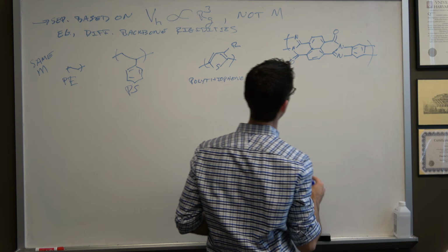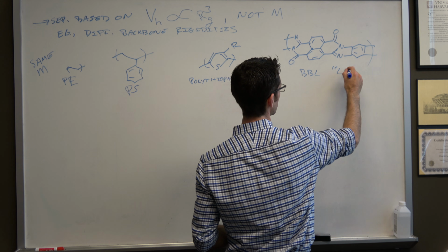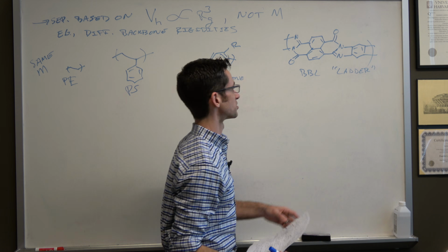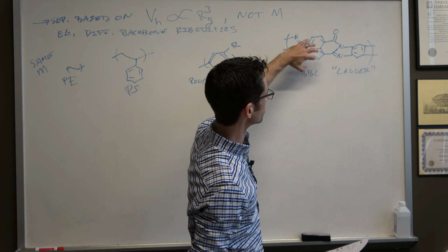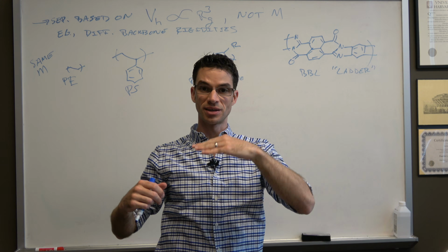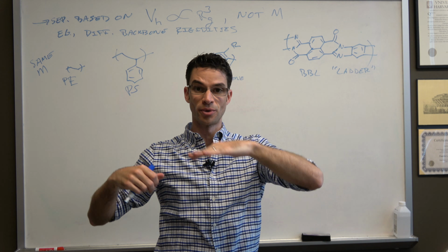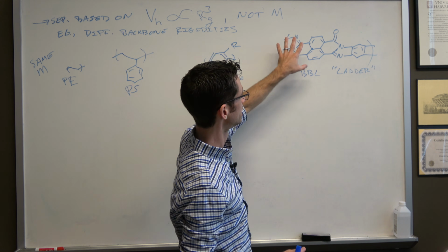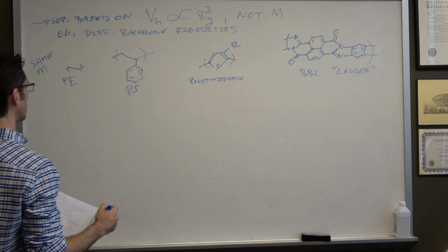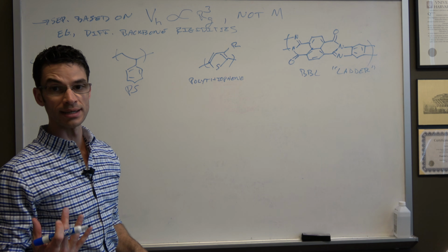This is a ladder polymer called BBL. And it's called a ladder polymer because it has rungs on a ladder, like you could climb this, because it really has 2 backbones along the entire molecular axis with rungs the entire way. So it's a very rigid polymer. And let's just schematically think about how these things ball up once they're in solution.